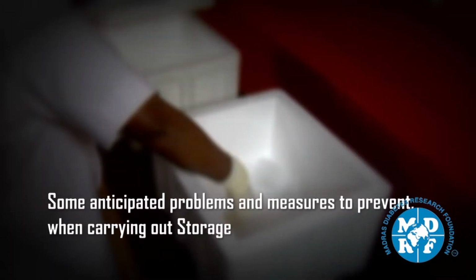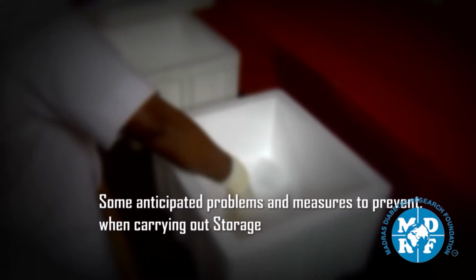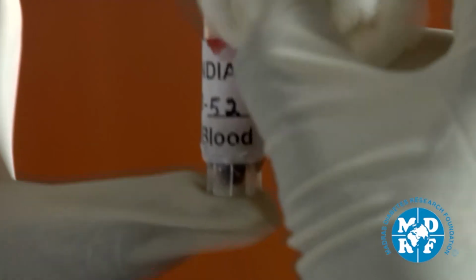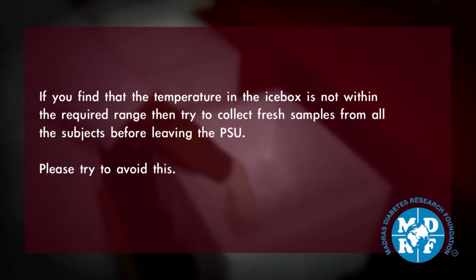Some anticipated problems and measures to prevent when carrying out storage. If the sample spills, then seal the vials properly with sellotape. If you find that the temperature in the ice box is not within the required range, then try to collect fresh samples from all the subjects before leaving the PSU. Please try to avoid this.